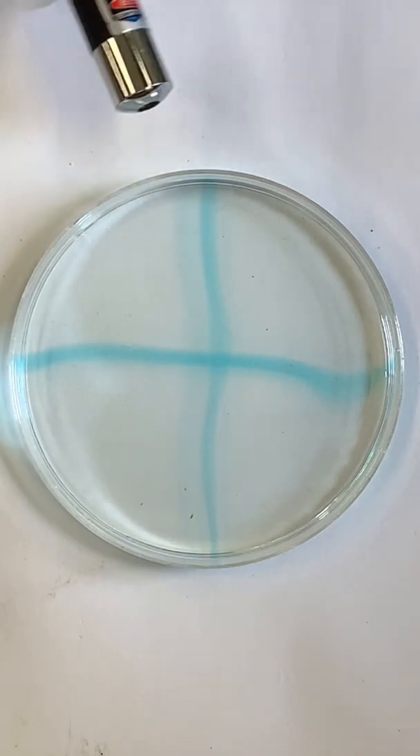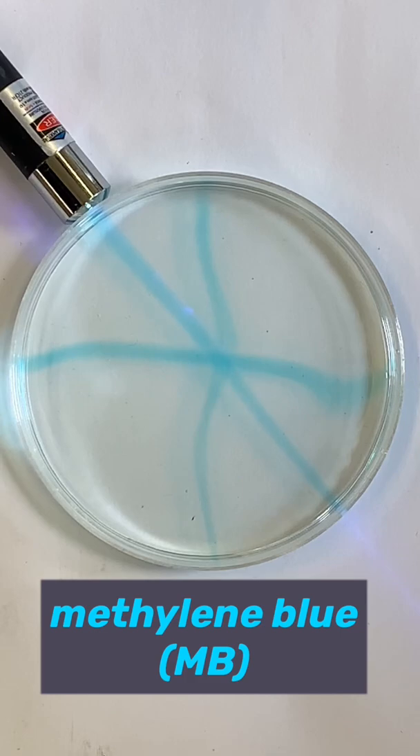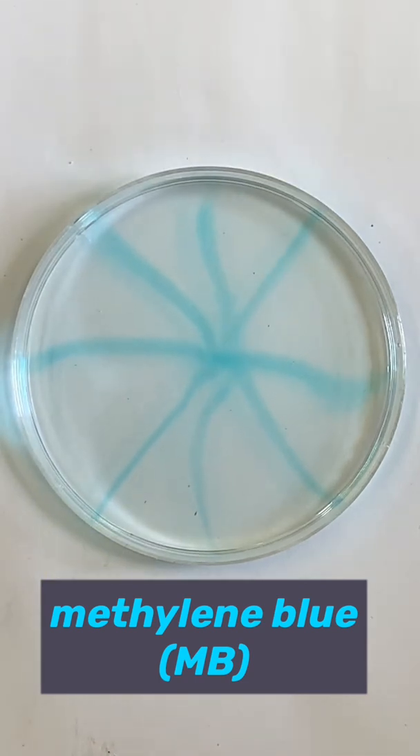The solution contains a colorless form of the dye known as methylene blue and tin ions with a plus four charge. When supplied with energy from the laser beam, the colorless dye and the tin ions react to form the colored form of the dye.